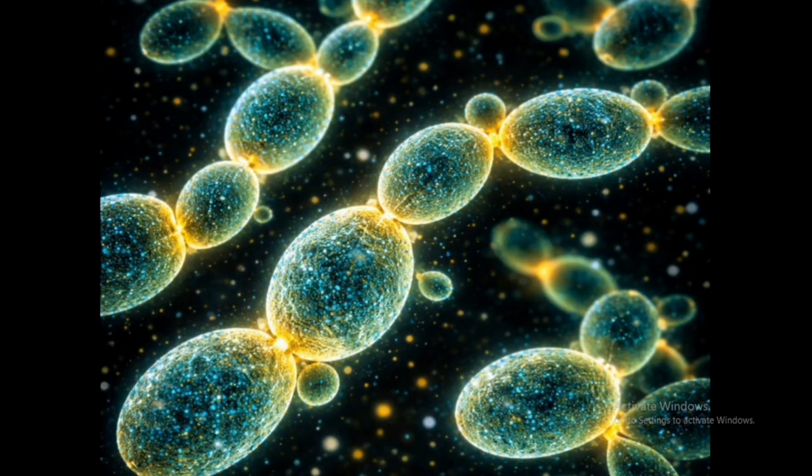Now we can see one more picture. Here, on the dark background, we see a fungus, for example Candida albicans. Over the dark background, we can see the image very clearly. This is a special feature of the dark field microscope: without staining, we can watch living microorganisms.